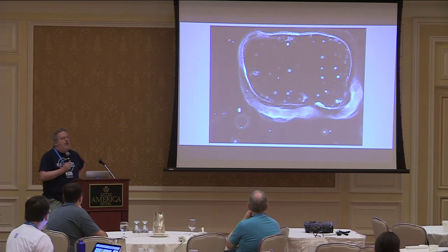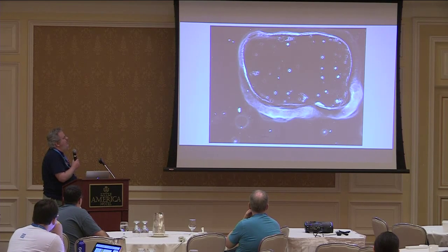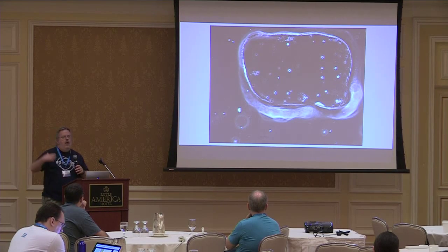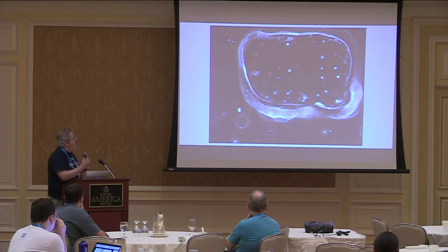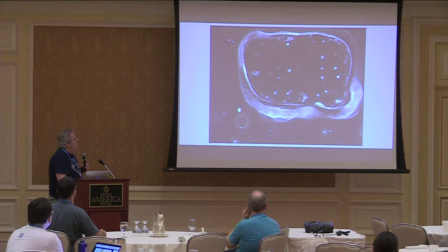What we normally get from our biologists are lots and lots of pictures that look like this. This is maybe one of the not so great ones, at least from our point of view, as trying to analyze these images. So these are hematopoietic stem cells. So they're like blood immune system cells. And in fact, we weren't even sure to start off with what we were really looking for here.